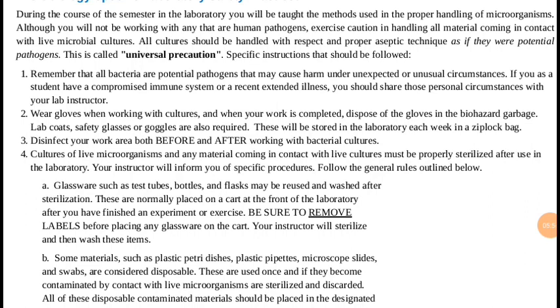Number two, you should wear gloves while working with cultures, and when your work is completed, dispose of the gloves in the biohazard garbage. You should dispose of gloves after wearing them. These gloves should not be worn for a long period of time, and they should not be shared.